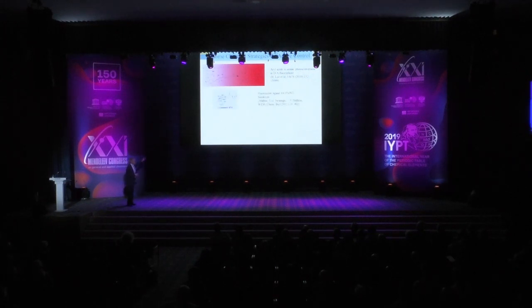Another scheme is to label a molecule that you would call a ligand that binds somewhere that's important, like this molecule, saxitoxin, which binds to voltage-gated sodium channels on the surface of cells. Now the molecules that are moving around in solution, you don't see them very well because they're fuzzy, because of motion. But when they bind and sit on a channel, they sit at one place and you can localize the molecule that way.